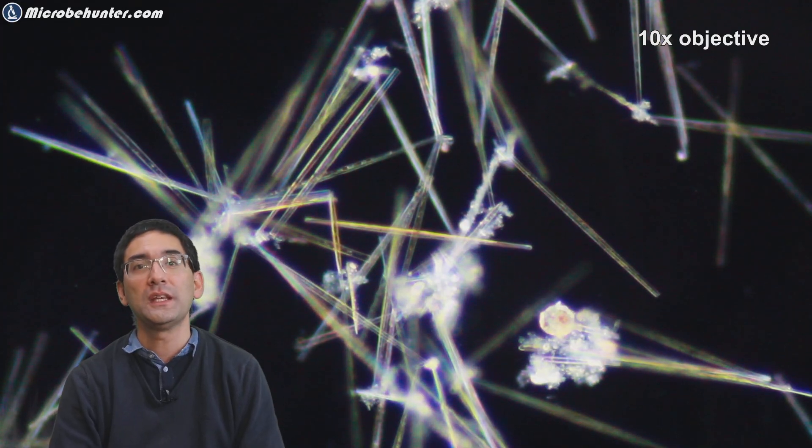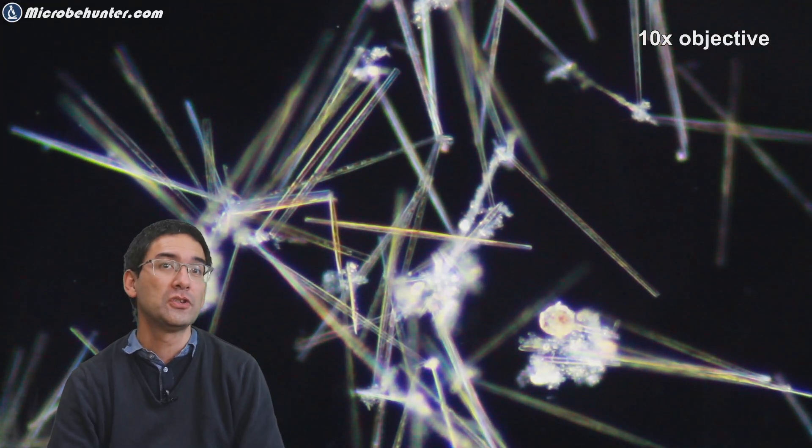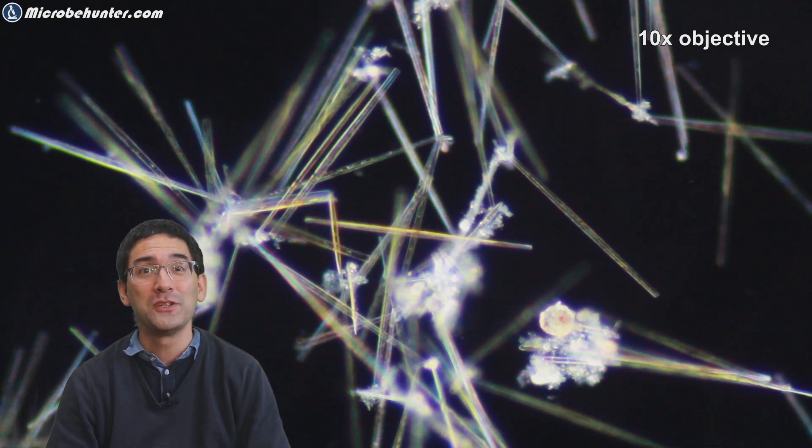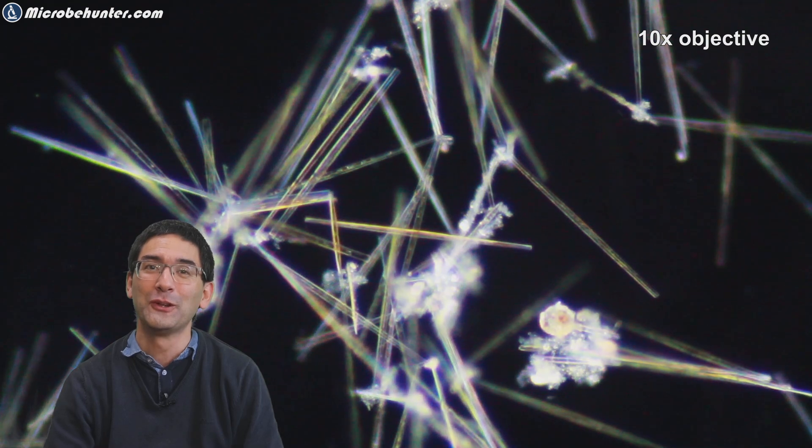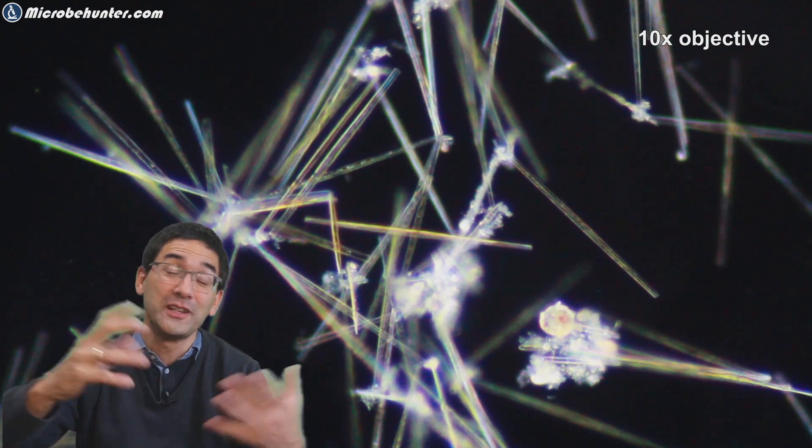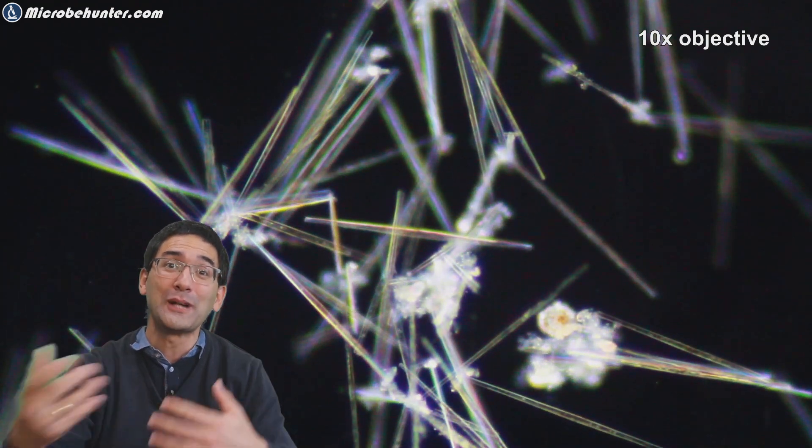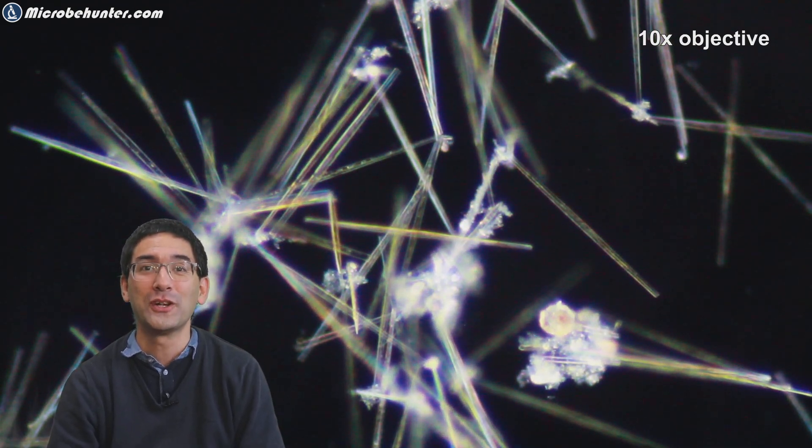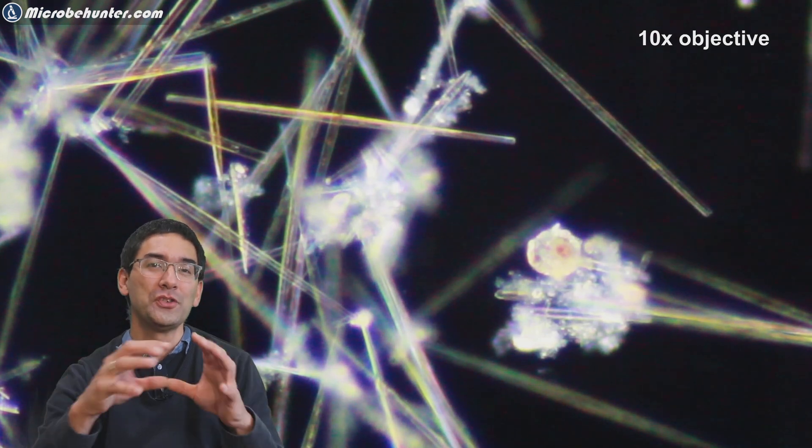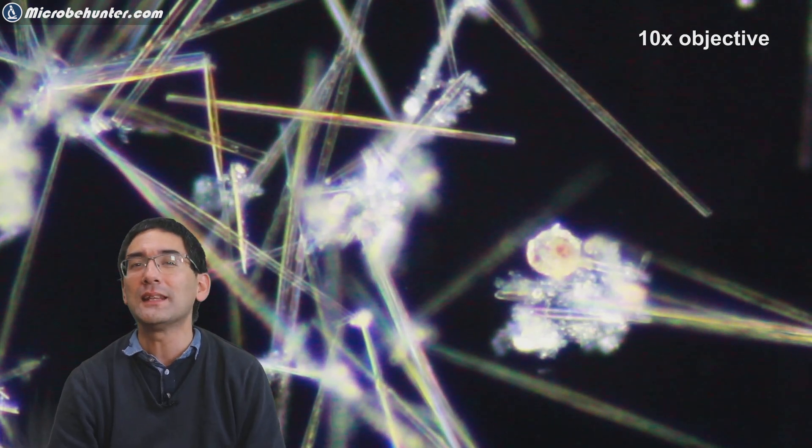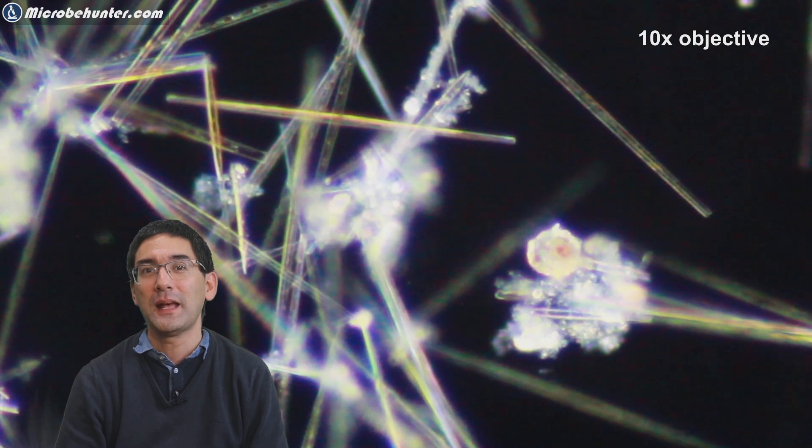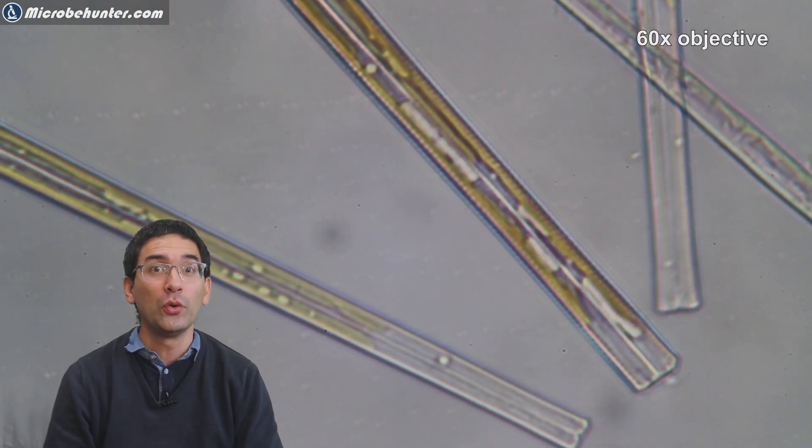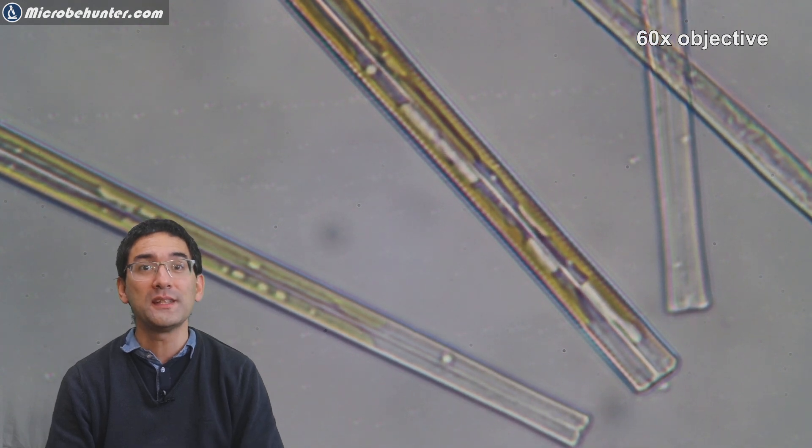Right now I'm using my dark field to give you a slightly different impression. All you have to do is insert a little patch stop filter. Then the algae, the diatoms in this case, look bright on a dark background. I consider this particularly nice to watch and observe. Those bright spots there, I think these could be the amoeba, but I'm going to show you later some of those to show you that there is movement going on. This is time lapse under high magnification.